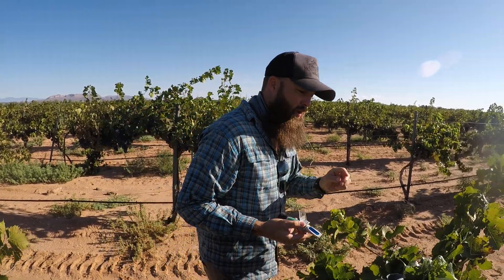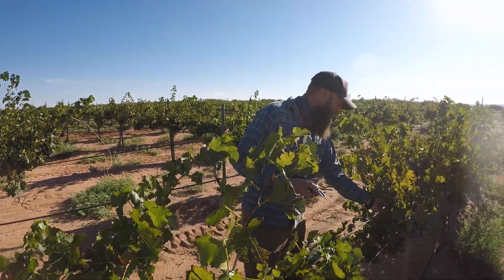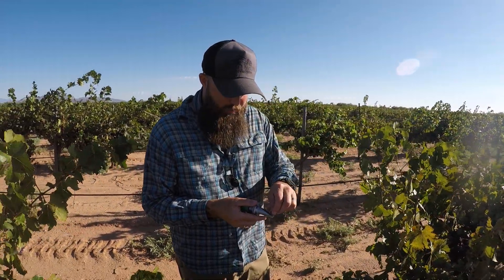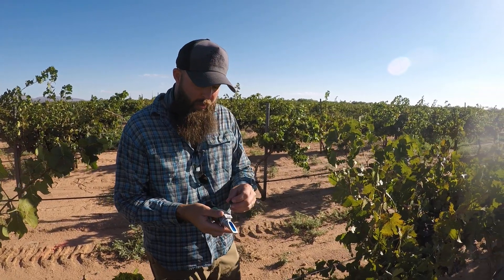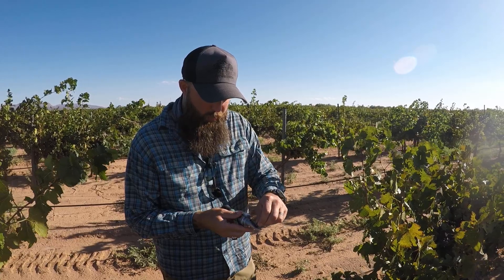So right now we're at about 20 brix off of what I tested there. I'll do this a couple hundred times with various berries throughout this block, and that'll give us a good assessment of what's here. I'm also going to take a bunch of them, mash them up, and get a hydrometer reading as well — so we'll check it a couple different ways.